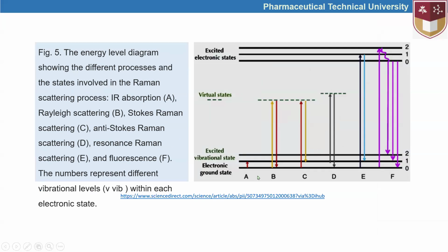And I would like to remind you that UV causes high energy differences before and after absorbance and emission, let's say. So here we can see different energy transmission in an example of electrons jumping from the ground state to the excited state. In case of IR, we do not see this kind of differences in the electrons.